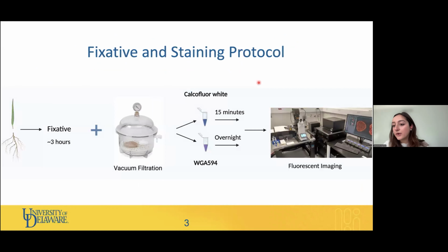We have a fixative and staining protocol that we developed. We inoculated the bacteria onto the plant roots and let those sit for three different time points. On those three time points, we harvested the roots, the shoots, and the internodes. The internodes are the root-shoot interface. Then we subjected them to a fixative protocol combined with vacuum filtration to remove excess particles that could interfere with the imaging efficiency, and would also allow for better penetration of the stains.